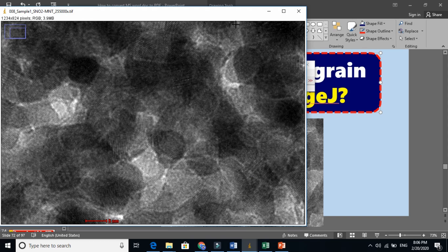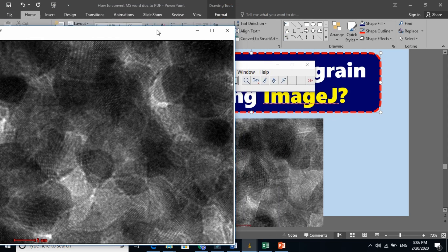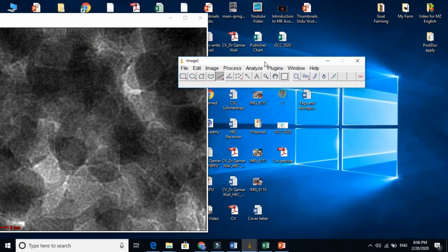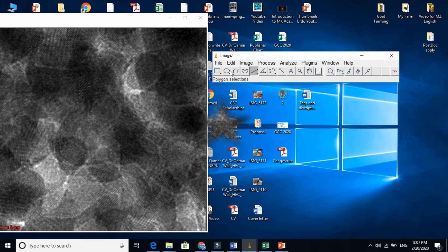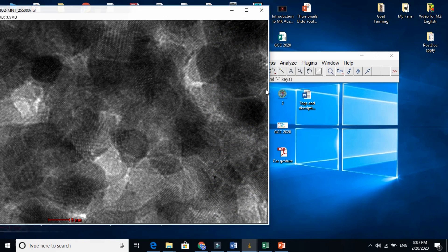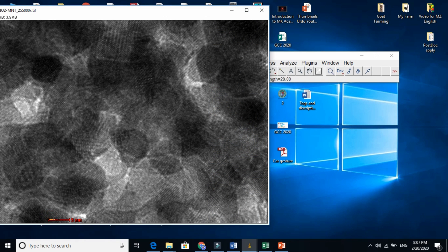So the first and foremost thing is, go to ImageJ. And because we are finding the length here of the grains, so tell the ImageJ what this bar is showing basically.